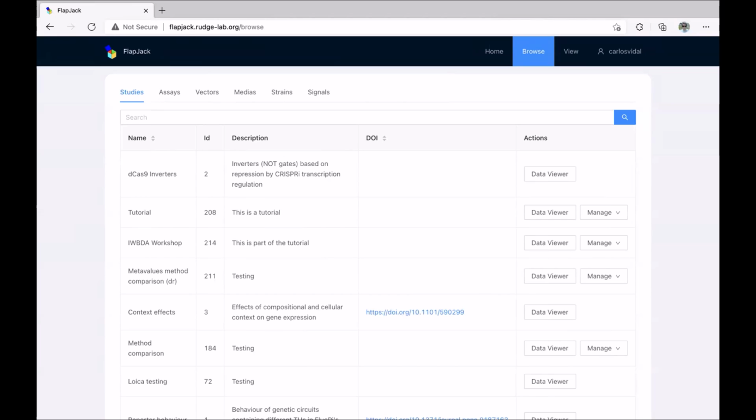And then the second question is that I think someone asked about bulk uploads, and I guess more precisely for me, it would be, are you able to do the same kind of reads of data, not from the web interface, but simply from a notebook?